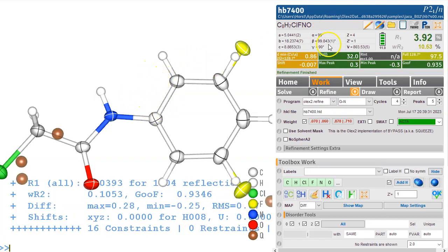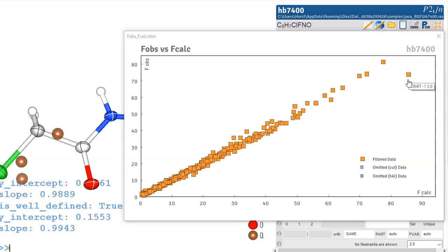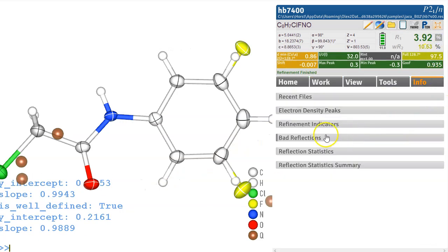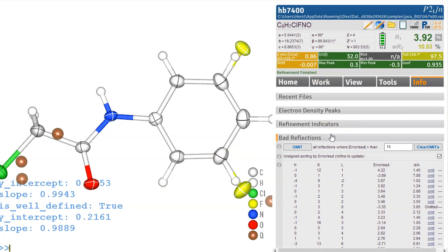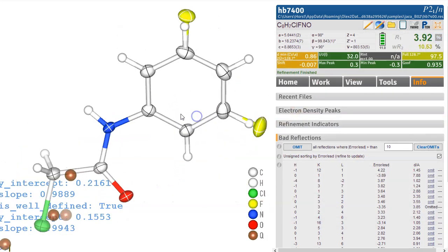Okay so here we are, this is almost the finished structure. Let's look at this, has one outlier so we probably want to omit this one here. Well hang on, before we omit the whole thing, this should also appear in the bad reflections, it doesn't actually disappear here so it's not as bad as it looks but let's just omit it from here.